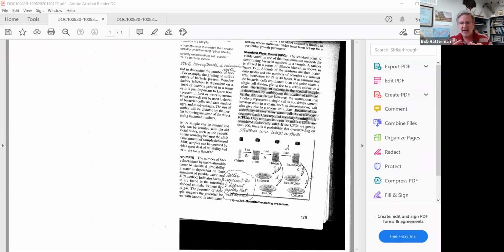I'm going to have a container with all the stains written on a piece of paper. So there'll be a simple stain, endospore, gram stain, acid fast, all the 6 stains I think we did. You're going to reach into that hat, pull out a piece of paper, and that will be the stain you will be asked to do for the second hands-on part of the practical.